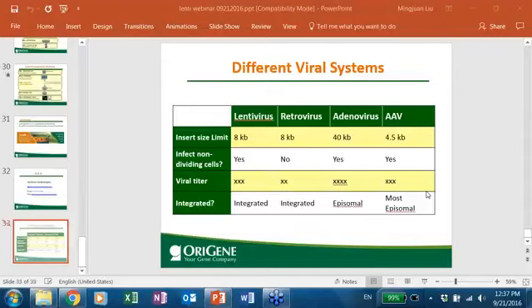So what is the question? I think what we're talking about here is, how is there silencing of specific genes if it's random integration? And I think the confusion is the introduction of shRNA. Got it. Now I understand the question.